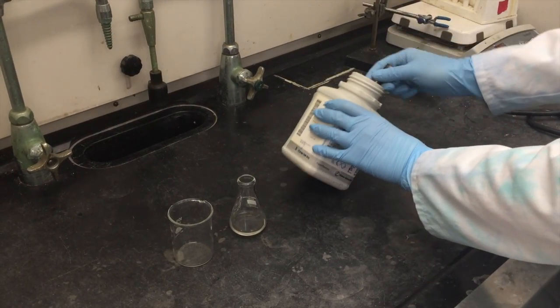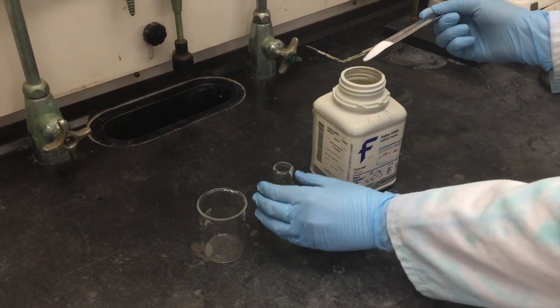Using a spatula, add a mound of sodium sulfate to your organic solvent and swirl the flask.